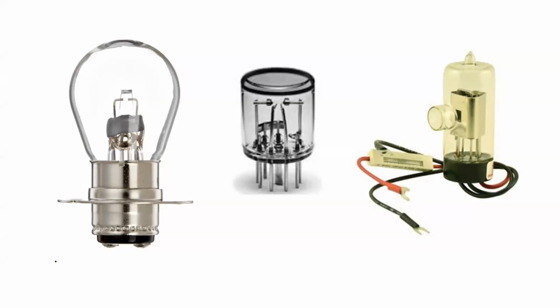Right, and so this is our tungsten lamp. Notice again how all this coil is very tight, right? This coil is as close together as those turns can get without touching each other. We don't want them to touch each other because you can actually cause the wire to melt if you have that current that touches at another point.